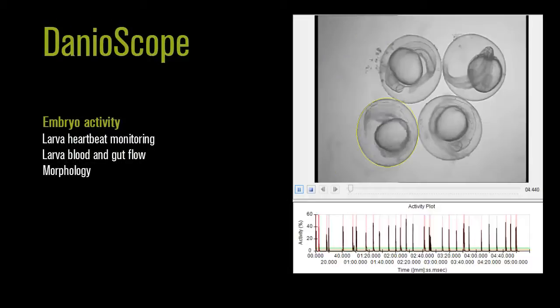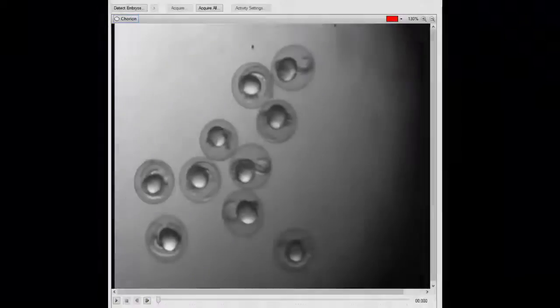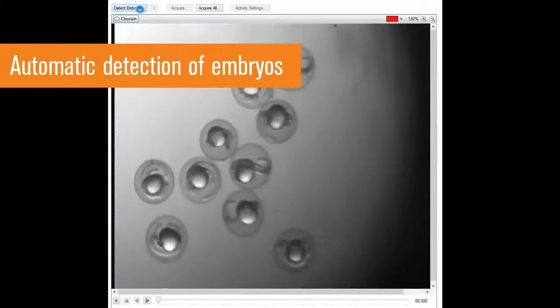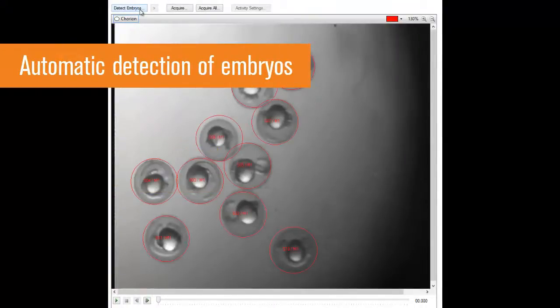Let's take a look at embryo activity such as tail flicks or convulsions. With one push of the button, DanioScope automatically detects the embryos in your video.